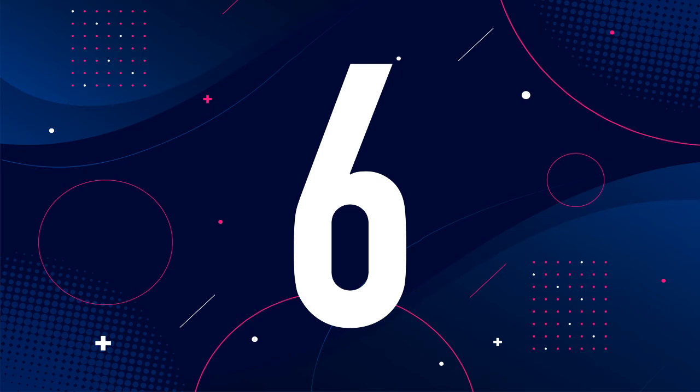We don't do it anymore. It was so hard. I have my students working so hard, and they're patiently waiting to dry in between every single step, and then they would go and look, and there'd be no flagella. It was just, there was no love for that stain, so we got rid of it. So on our flagella stain, what I do instead is I put out prepared slides. Much easier. There's no heartbreak, but we can see the flagella. Again, they just look like little hair-like extensions around the cells.